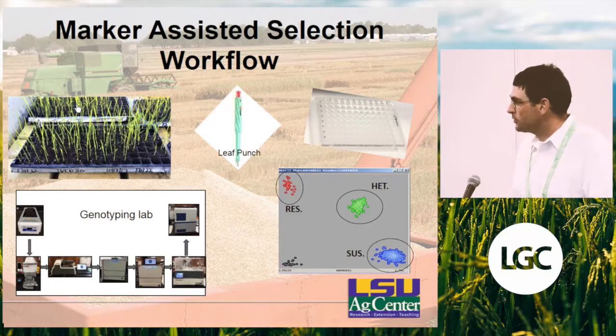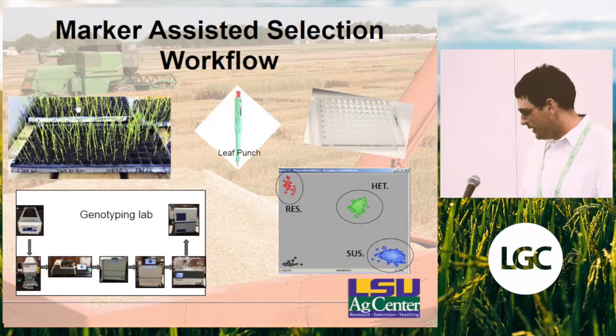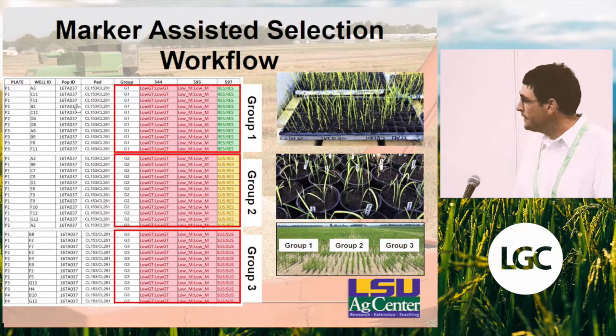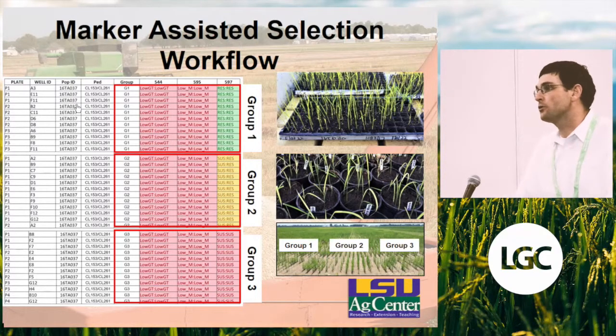Most of our trait markers, we do a good bit of work to try to get them to look. They don't always look this good, but something like this where you get very nice clear clusters and high data return. And then for our selection, I mentioned one trait. Let's say we wanted to fix it. You need 400 plants. Well, we're not going to do 400 plants because that doesn't really fit well in the plate. So we'll do 384.